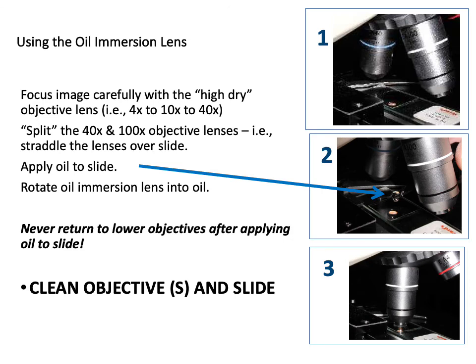So for the first part of this lab, when you are looking at bacteria, if we were in person, I would show you how to use what is called the oil immersion lens, or the 100x objective in our lab. Because you are just going to be provided pictures, I'm going to skip these instructions. But if you ever do need to use a microscope, the instructions for how to use the oil immersion lens are here.